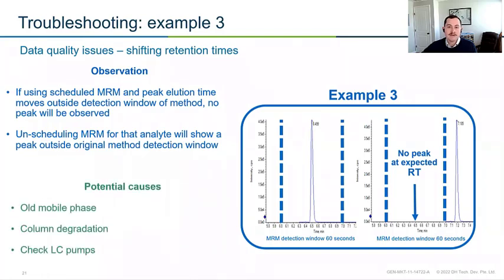And if we do see a peak, there are a few things we can do to try to address this. So let's say our peak is just outside our retention time window. The easiest thing to do would be to make some fresh mobile phase. Maybe we've let our mobile phase sit for quite a while. We were using formic acid, it's volatile, and it's sat too long, and now we have this retention time shift. Another really easy thing to do would just be to try a new batch of buffer. So let's say, again, we're using formic acid. Maybe that formic acid is super old. Maybe it's been left out on the counter overnight without a cap. Maybe the quality of it just isn't very good. Trying a new batch is usually a really easy solution to see, hey, does that help?